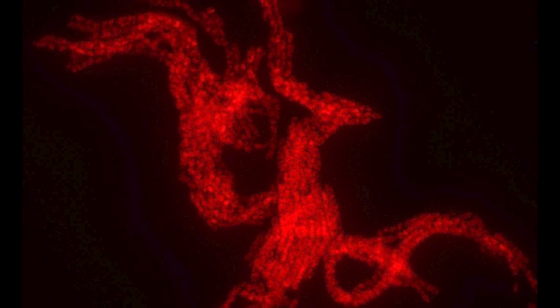It's like a phoenix recovering from nothing. The small particles you can see in the image are bacteria. They create a biofilm and grow next to each other, but for some reason they create this unique form.